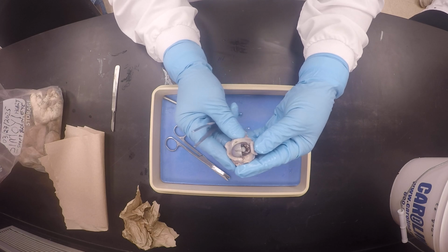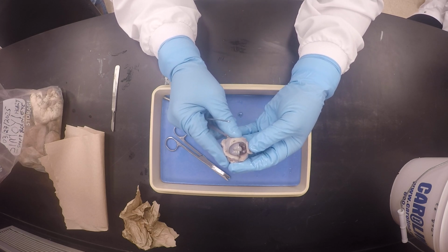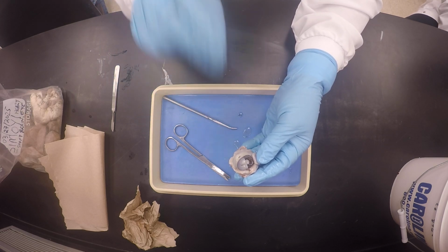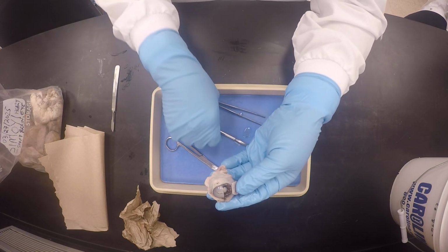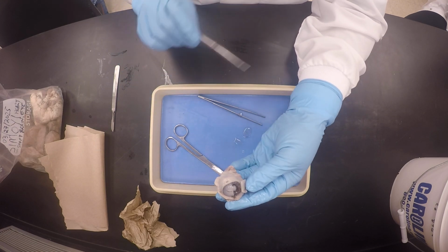So we cut on the cornea. Look here. Did you see, my good friends? It's a brown-eyed sheep, so it's got brown eyes. This is an iris, and there's a pupil right there. And behind it is the lens. Isn't that coolio? This is so slimy. You see, there's the lens right there.